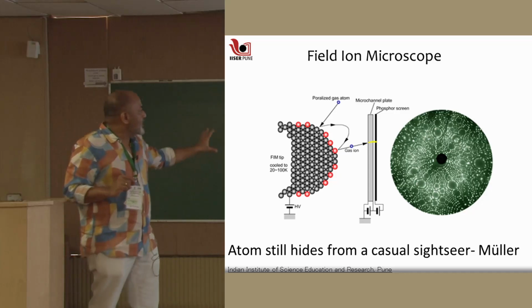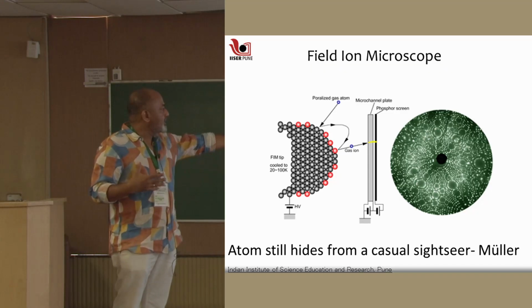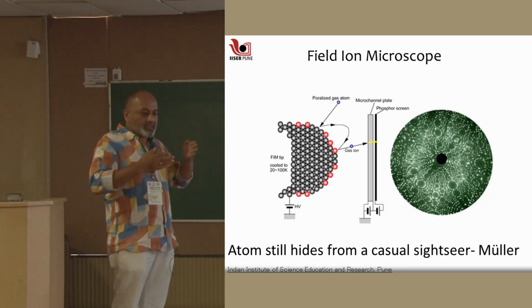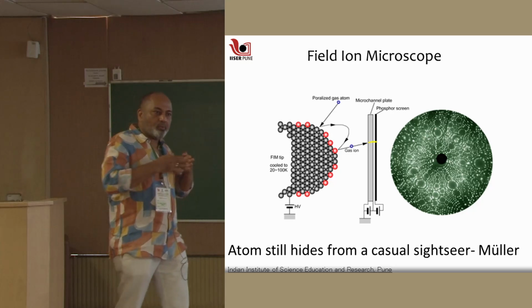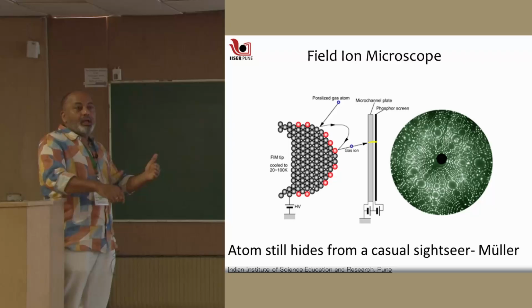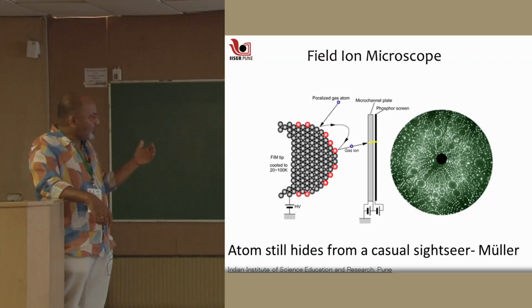All right. So many such atoms will do a projection of a tip on the screen, and the bright spots that you see on the screen are a projection of a hyperboloid tip on a plane, and this is how for the first time ever mankind saw the atoms.